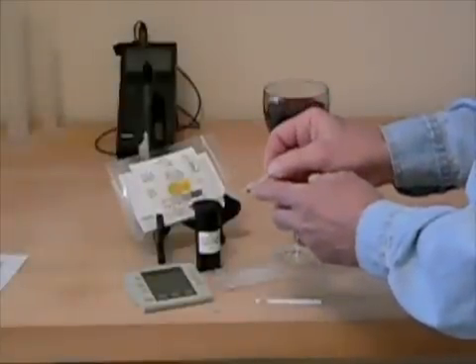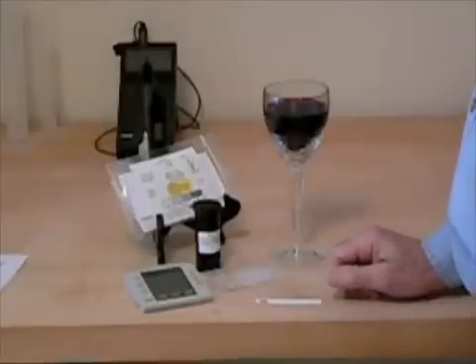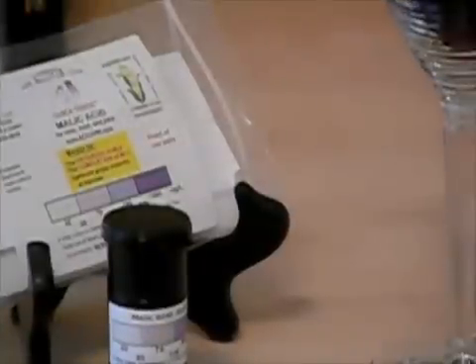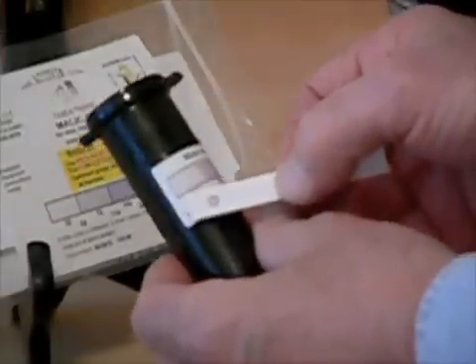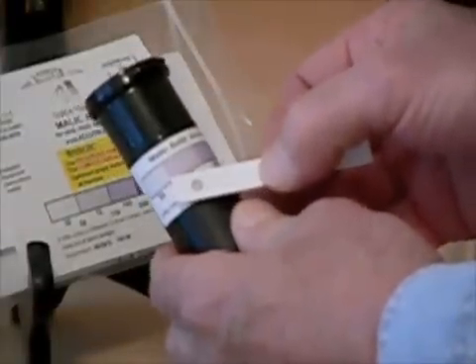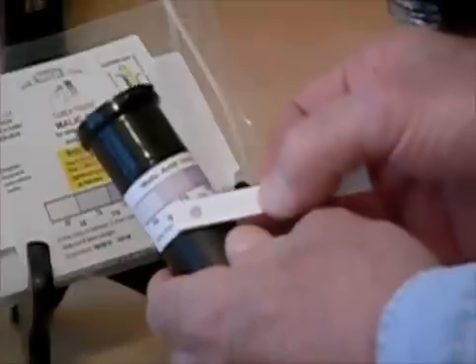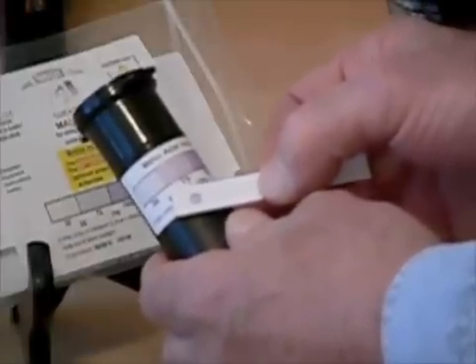Excess sample is contained in the overflow bulb. Wait four minutes for color development — we'll start a timer. Time's up. We'll match the color that's developed to the color chart. The malic acid level in this wine is 75 milligrams per liter. That's considered as having completed malolactic fermentation.